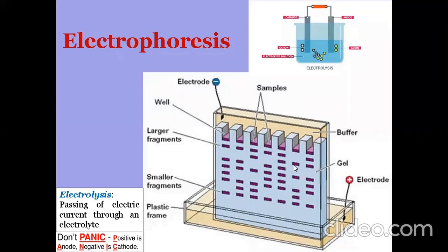So they share the same size protein, and similarly these samples share the same size proteins, like bands, size bands, most probably proteins, and here they share the same size proteins, and so on. If there is a ladder, we can comparatively say the size of the protein. There is no ladder here, so we cannot size these proteins.